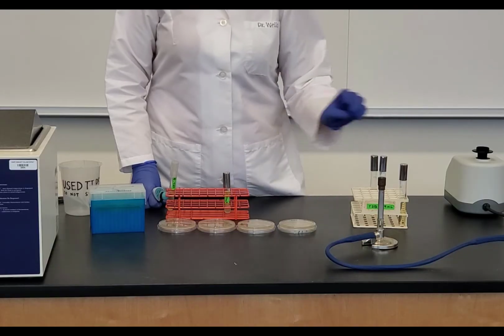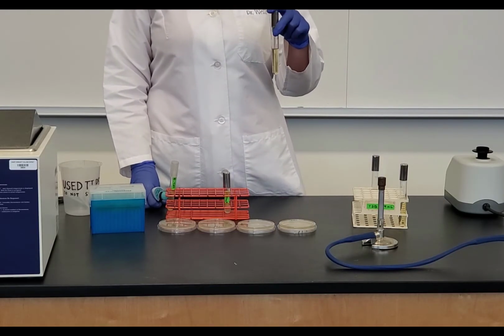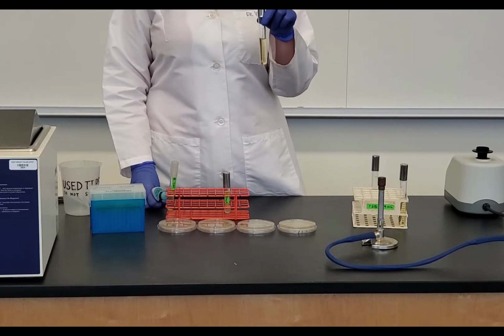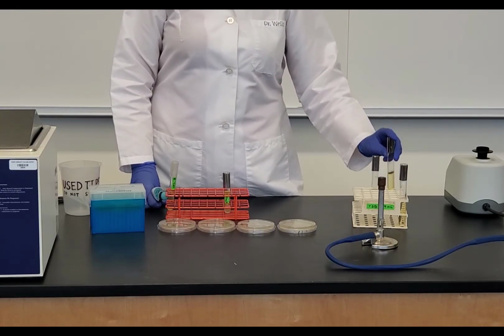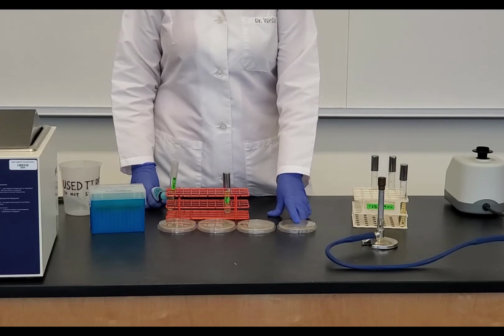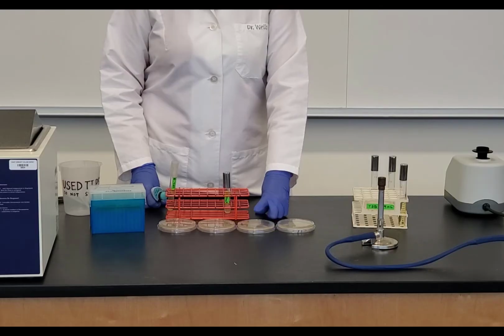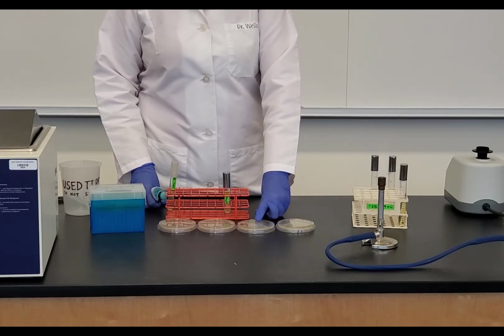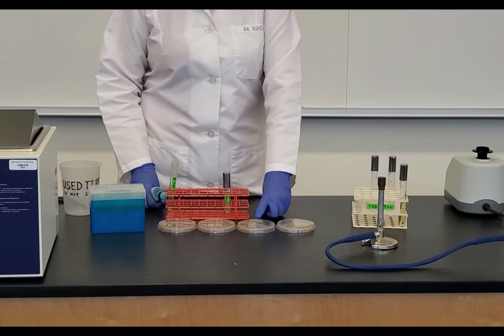So notice that my first plate is labeled 10 to the negative 4. So remember that if this dilution is 10 to the negative 4 and I plate 1 milliliter, my dilution is still going to be 10 to the negative 4. So I have to plate 1 milliliter of my 10 to the negative 4 onto my 10 to the negative 4 plate. For my 10 to the negative 5, I need 10-fold less. So for that one, I'm only going to transfer 0.1 milliliters, 10-fold less.